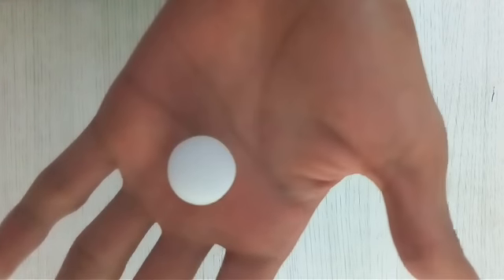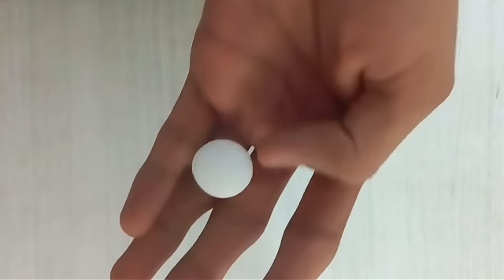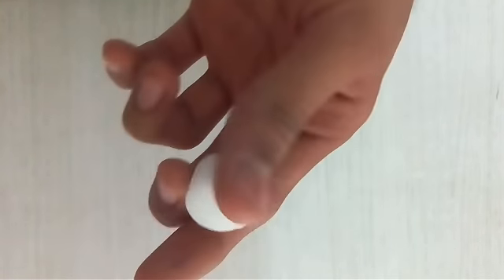It is a white crystalline solid, and here I have some on hand. We use this in our home, we put it in clothes and in wash basins, where we disinfect bacteria and get a fragrance. So we're gonna make carbon from this.